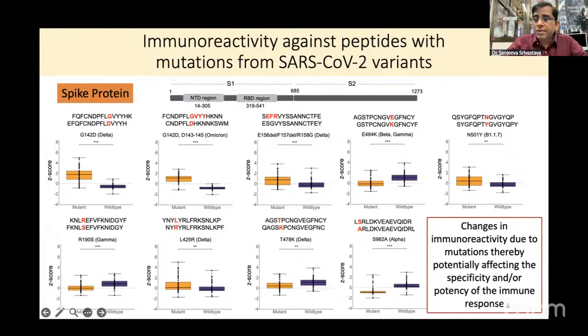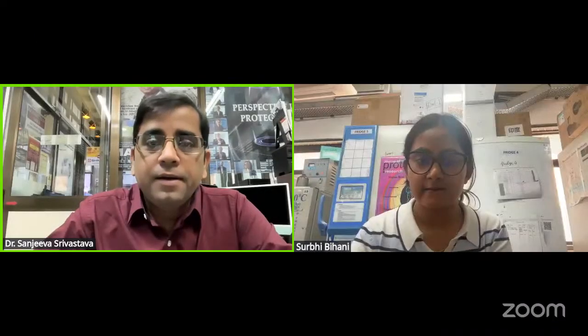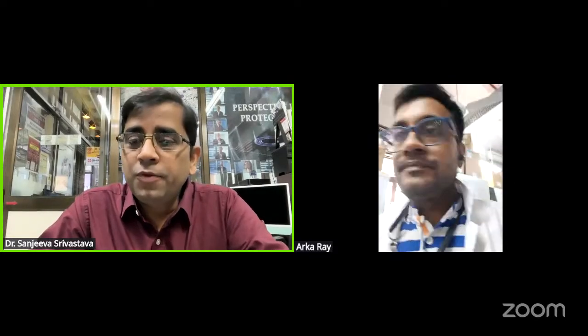All right, thank you, Surbi. Now I request Surbi and Arka to give a glimpse of the microarray setup, the scanner, and the slides that we have in the lab. Although we have shown some experiments and an overview, it will be good for you to see it directly from the lab. Yes, sir.